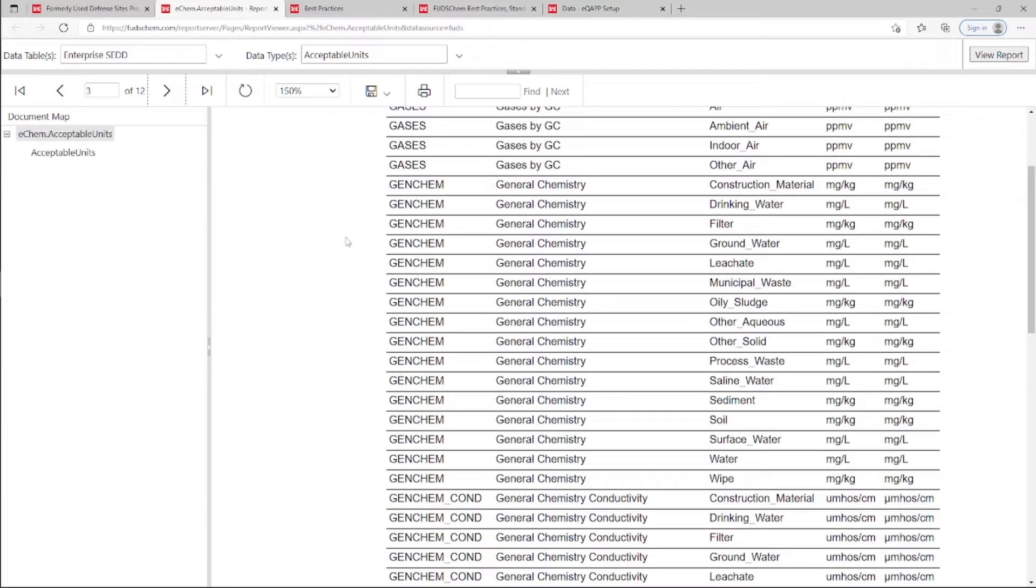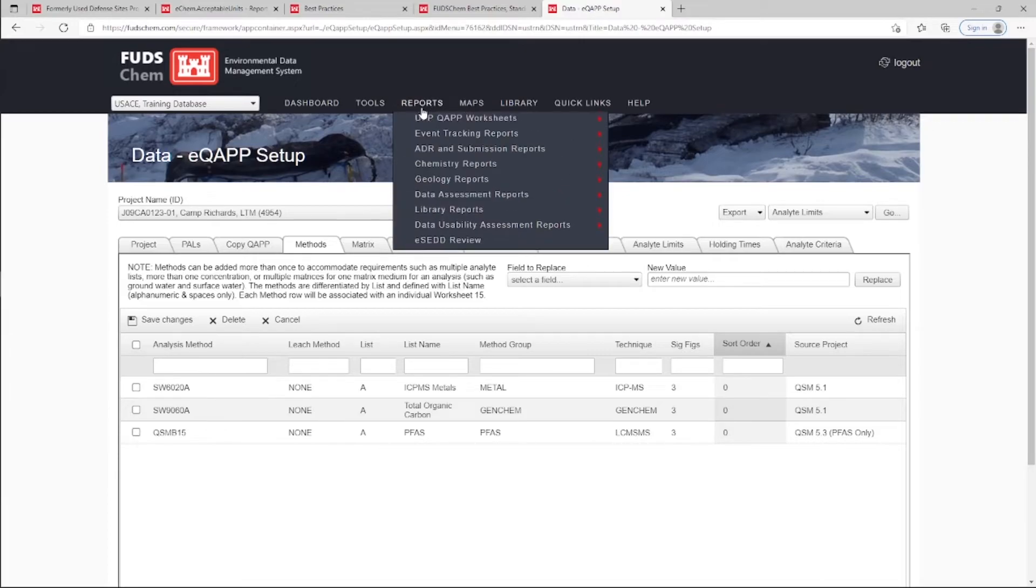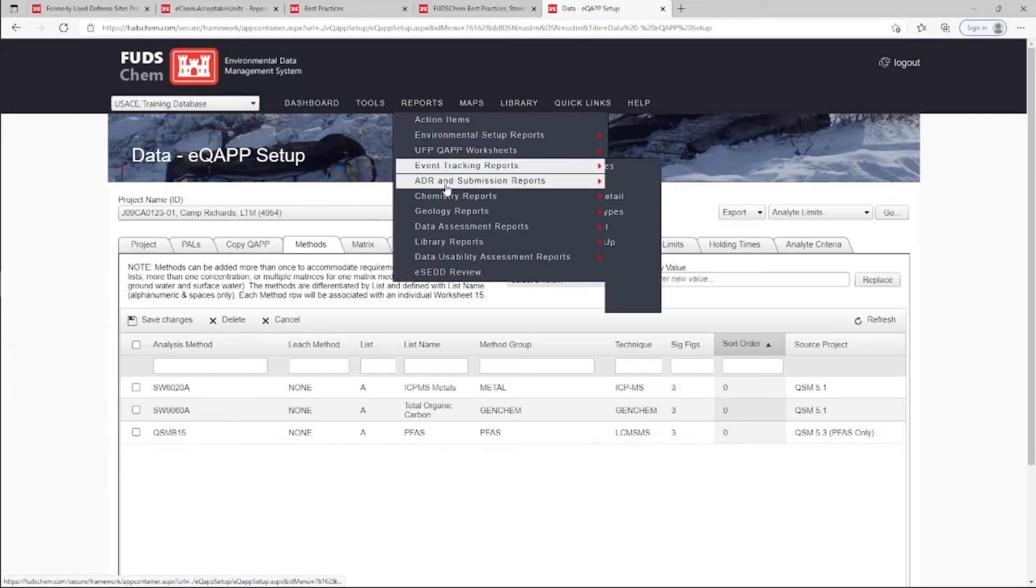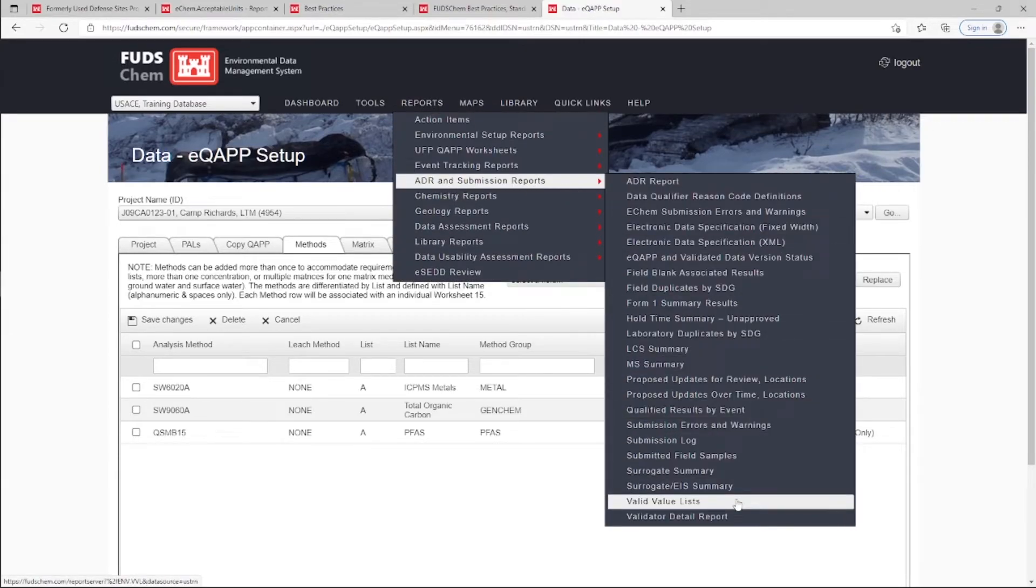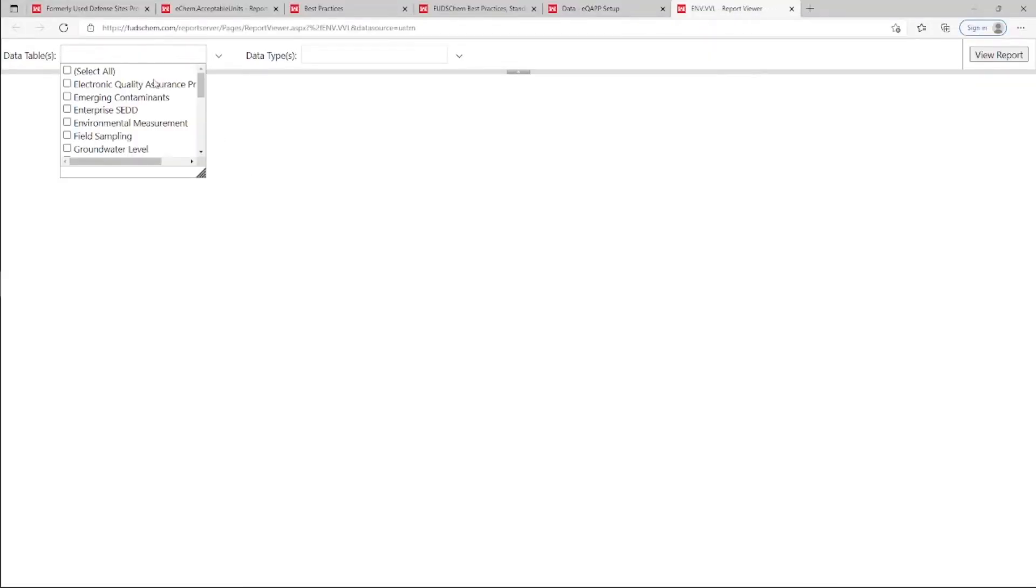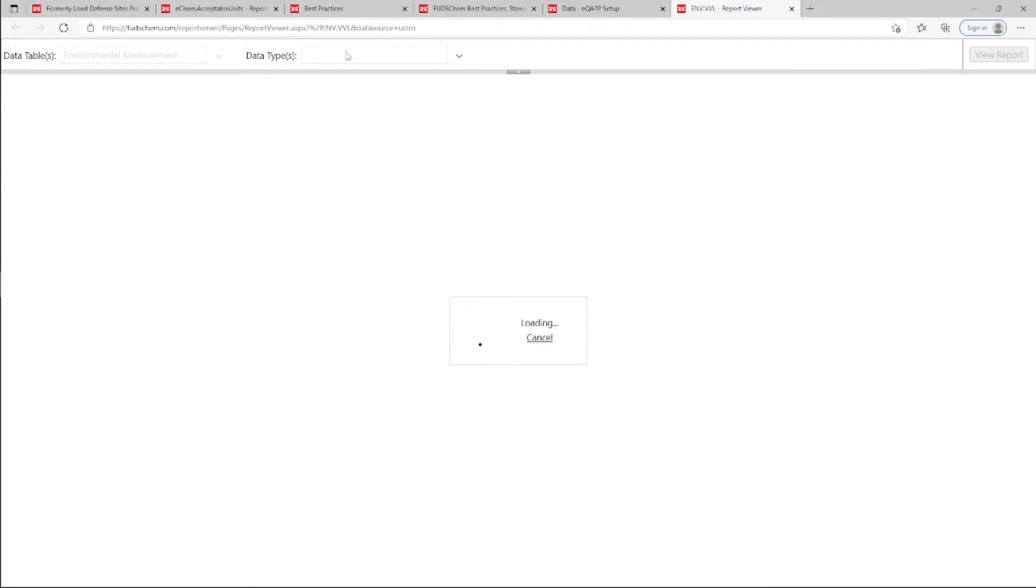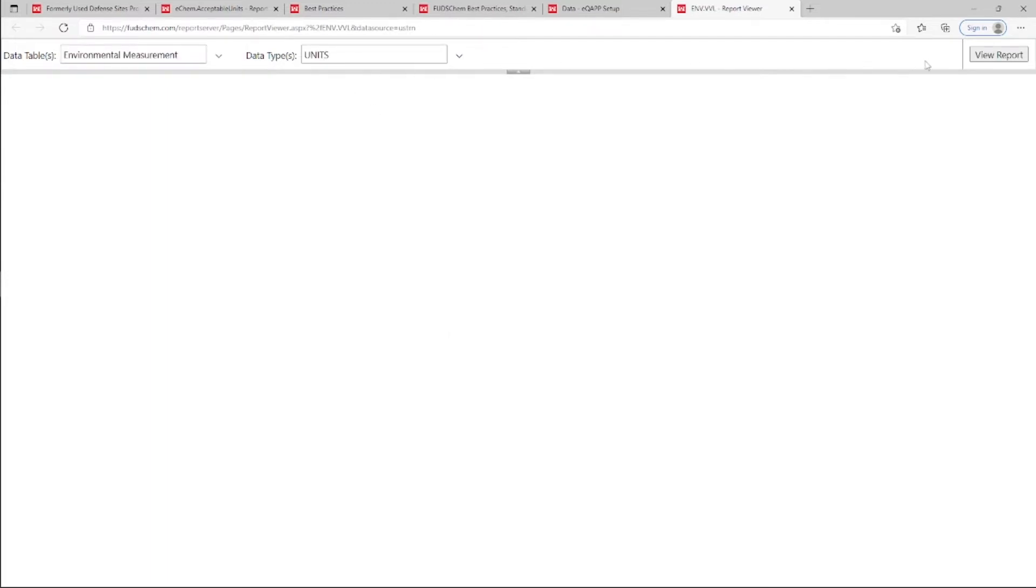For non-chemistry data types, units included as valid values can be found by going to Reports, ADR and Submission Reports, Valid Value Lists. Choose the data table, for example, Environmental Measurement, and select Units for the data type. Click View Report.